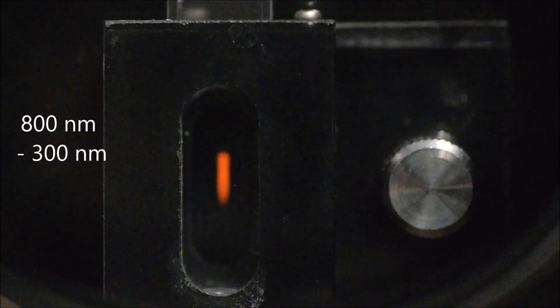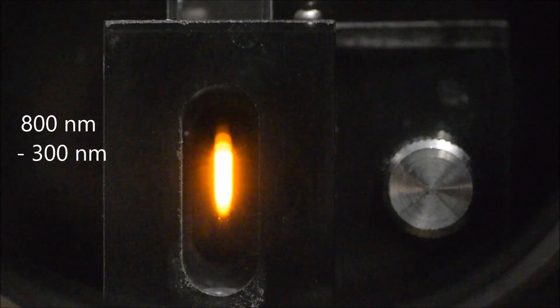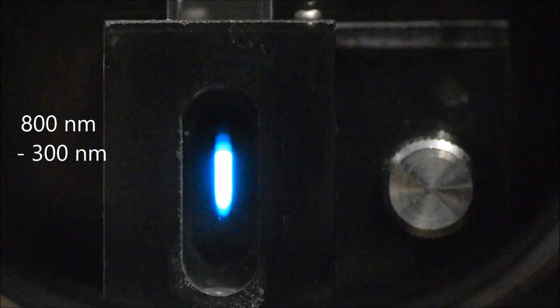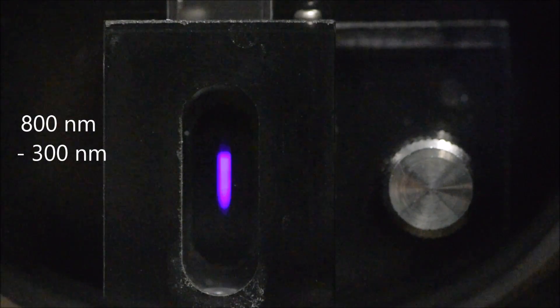So now back to the question of how did we pick 650 nanometers. Well what we're looking at here is a view along the beam path through the cuvette and instead of choosing one wavelength we're going from 800 nanometers which as we know from physics is red all the way up to 300 nanometers which we know is into the ultraviolet and we can see in this clear vial that all of the colors are absorbed equally well or equally poorly and they can all be detected by the camera.